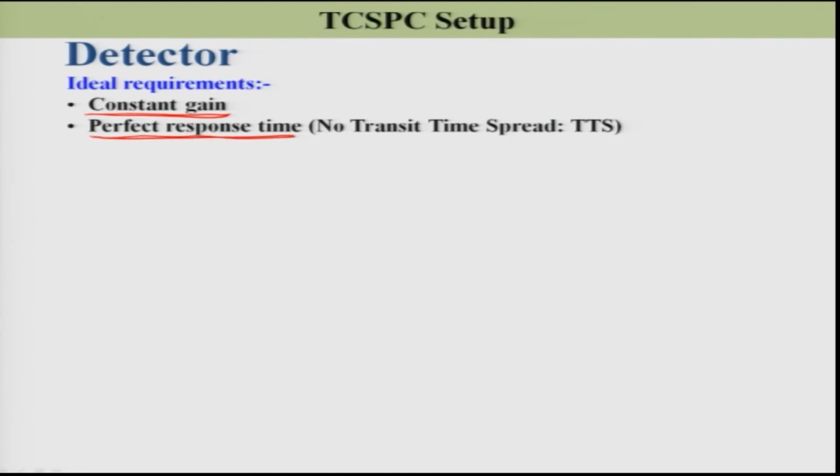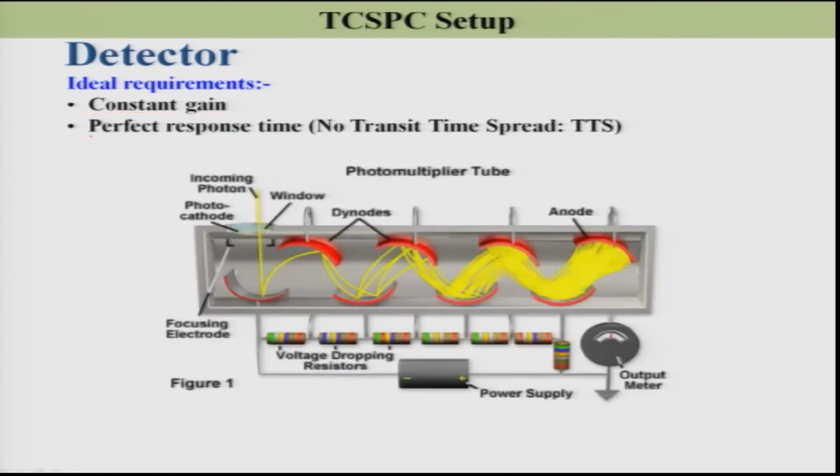To explain these two, let me show you a typical detector, a photomultiplier tube. As I said earlier, this is based on the photoelectric effect.